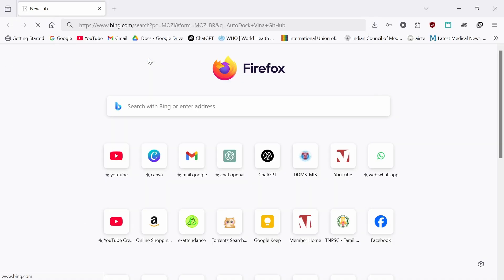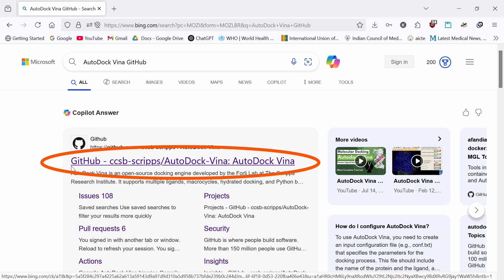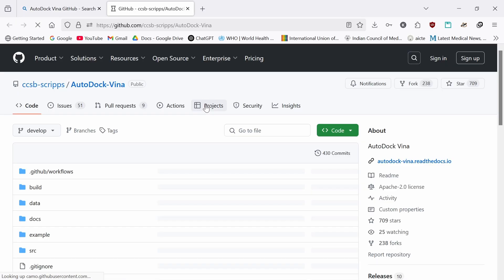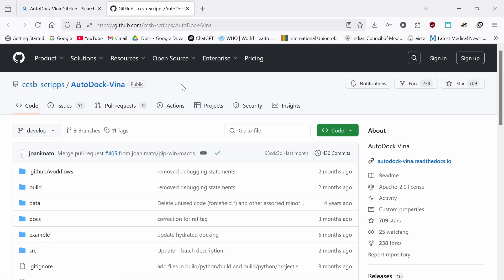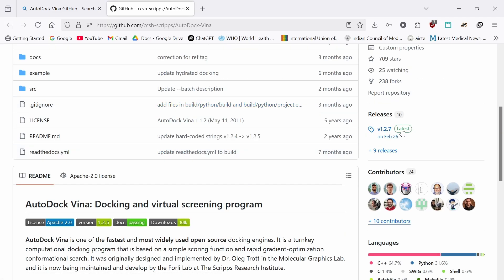Step 1 is how to install Vina. Go to Google and search for AutoDock Vina GitHub and open this GitHub page. Or you can go to this direct link: CCSB scripts slash AutoDock Vina.